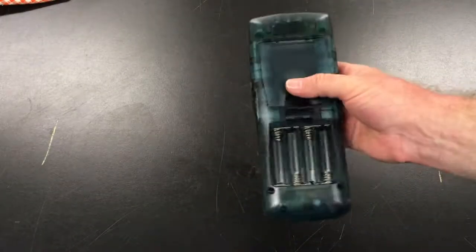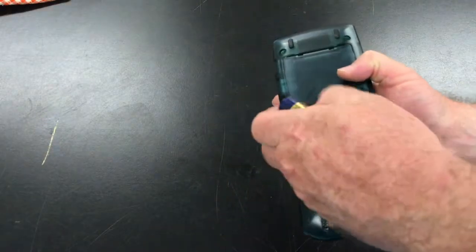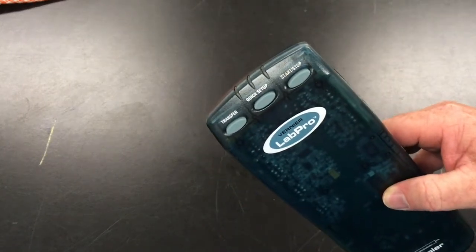This is our data logger. And we use this type, it's Vernier, needs batteries. You put fresh batteries in each time and you should hear this noise. When the kids are doing it, make sure that you hear that noise. And make sure when they're putting the batteries in, they don't push buttons. Because if they start pushing these buttons at the top, then it'll start collecting data before you have anything attached to it.